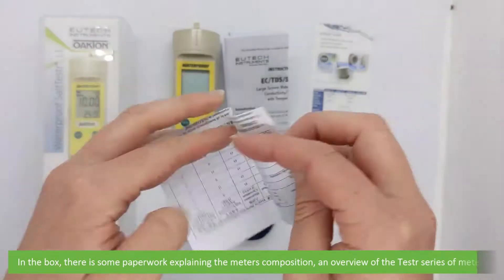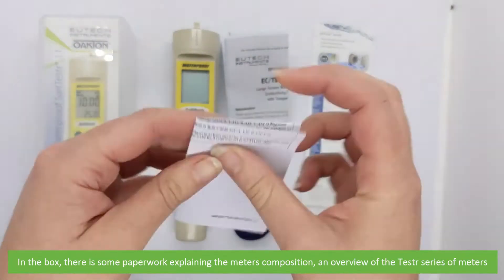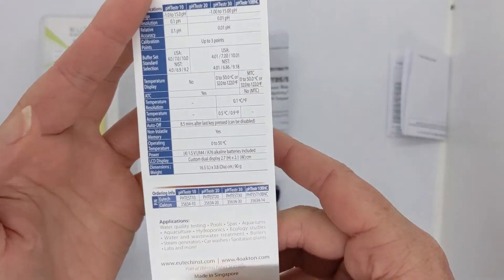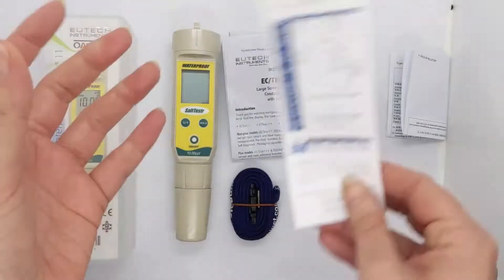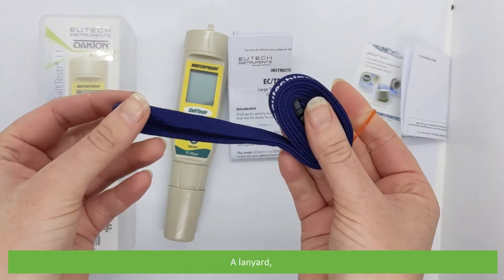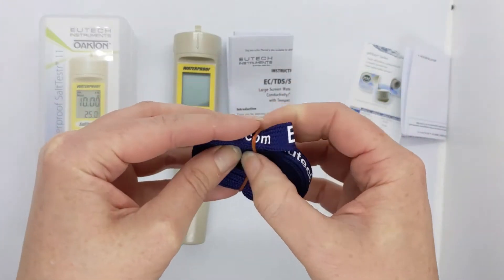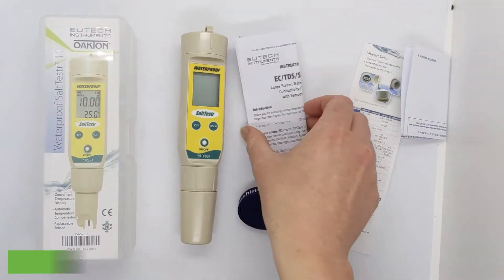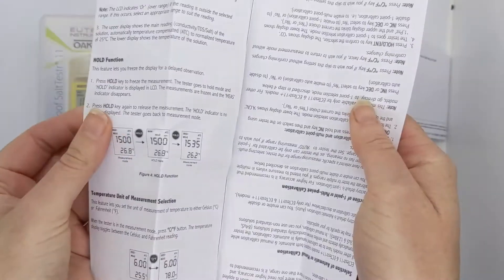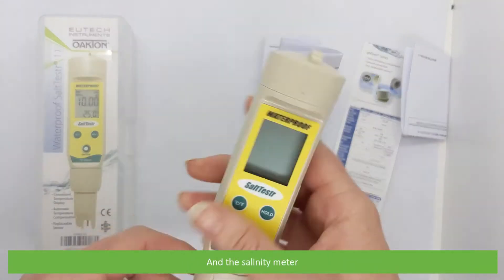In the box there is some paperwork explaining the meter's composition, an overview of the tester series of meters, a lanyard, a user manual, and the salinity meter.